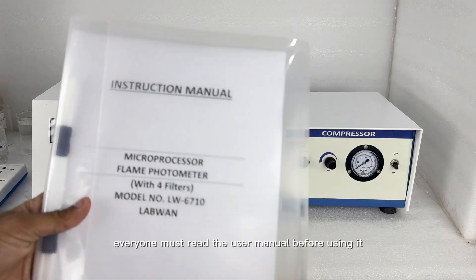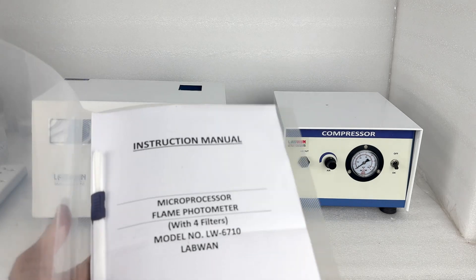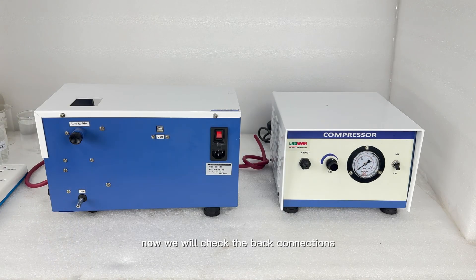Everyone must read the user manual before using it. Now we will check the back connections and then connect the power supply.